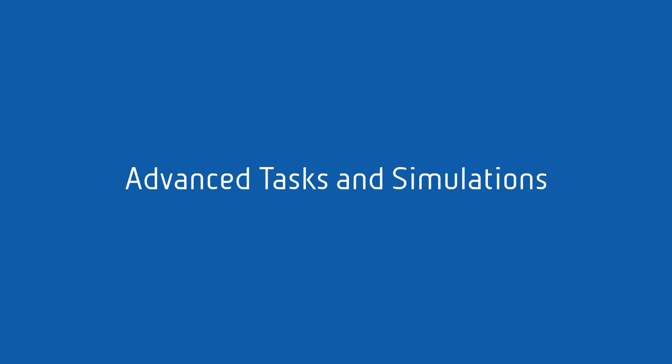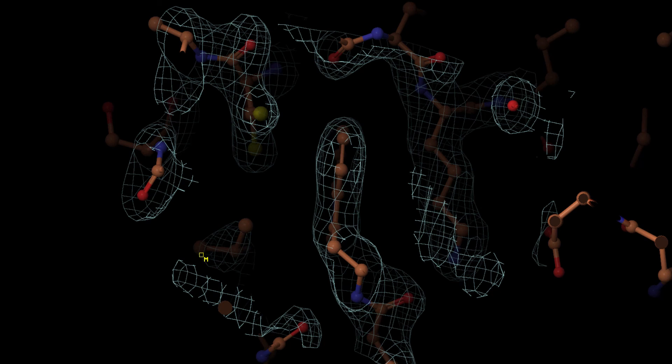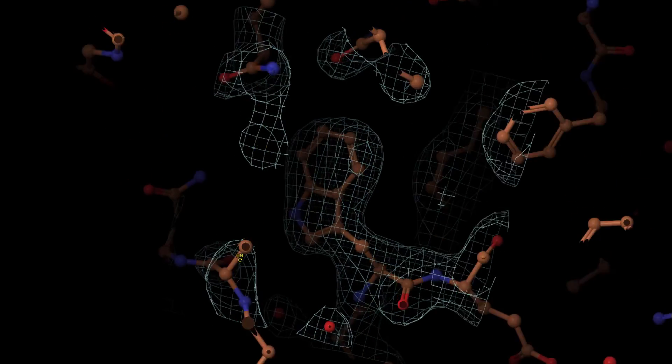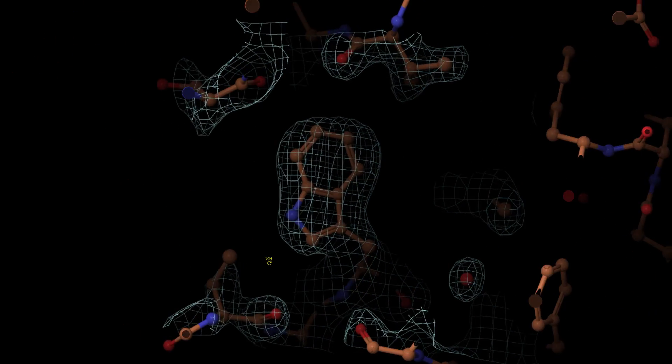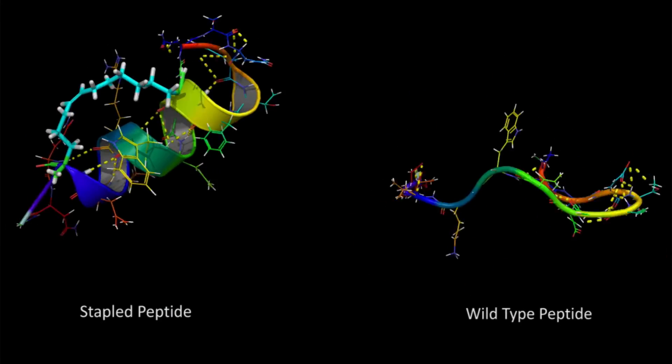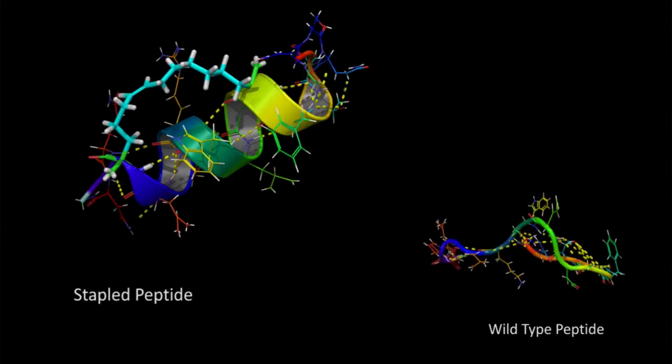Finally, gain access to advanced tasks and simulations such as protein X-ray refinement with PrimeX or molecular dynamics with Desmond.